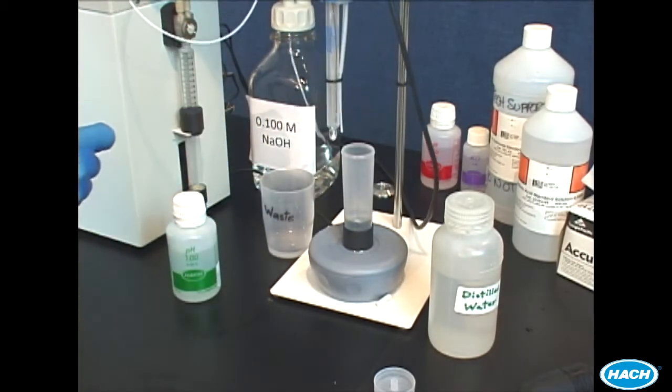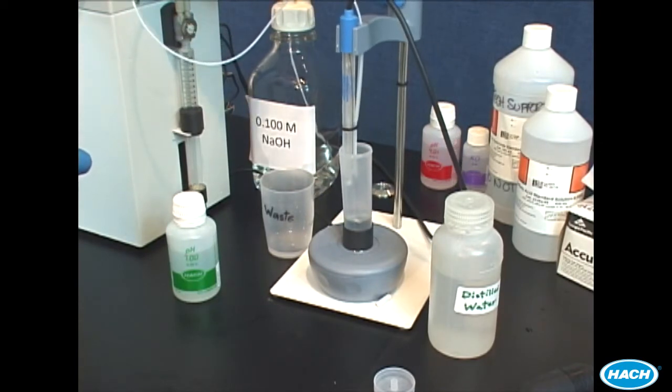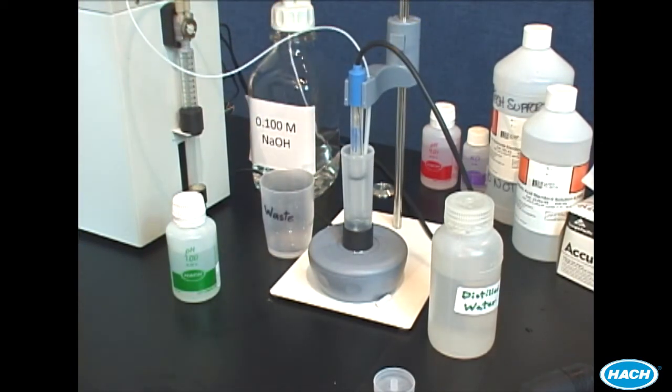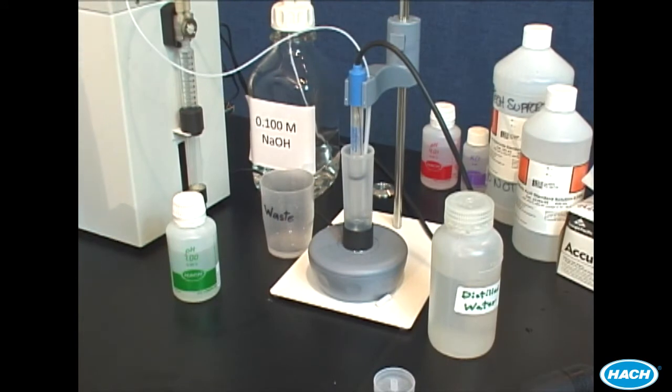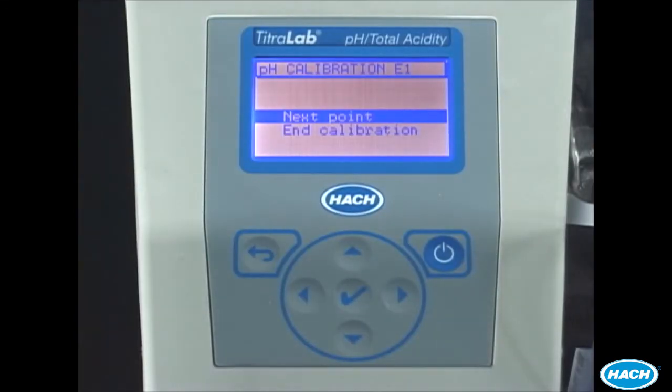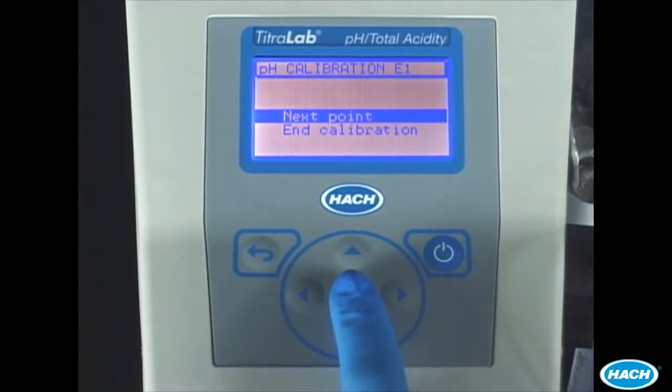Lower the pH electrode into the buffer, making sure the end of the pH electrode is completely immersed in the buffer. Select Next Point and press the check mark to begin measuring the pH 7 buffer.